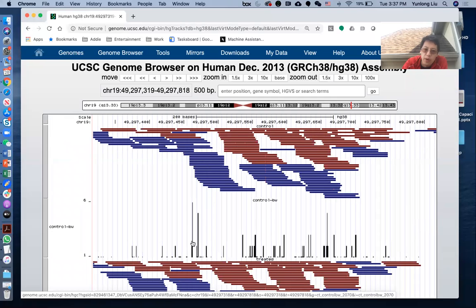So now you are seeing some of the information like this. It's very much like a BigWig file, which means I'm not only interested in start and end location, but for each individual segment, I want to see what the signals are. It can be a continuous signal at this particular location.